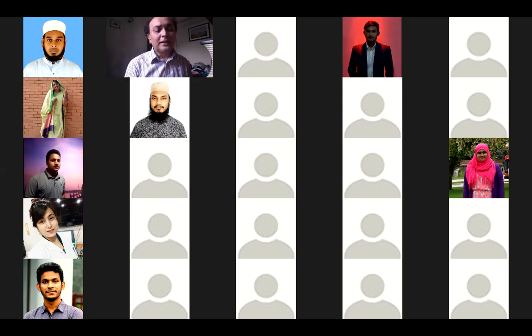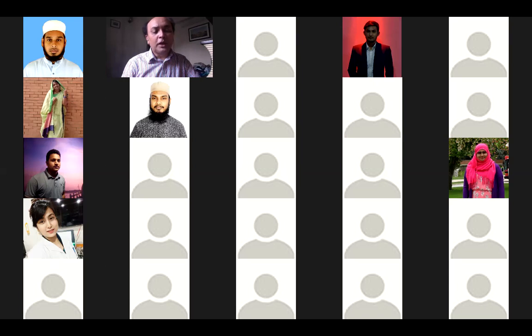So thin layer chromatography, and then column chromatography, big column for separation of the large amount of compounds. And then when you get semi-purified compound, for example, 2 compounds in a mixture, after the column chromatography, sometimes column chromatography you need to do several times, and then you can use the HPLC. So only single chromatography may not give you a purified compound.